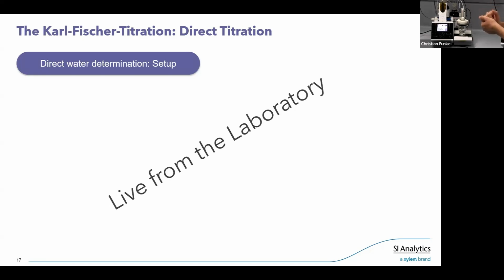Okay, but we saw on the graph this direct method is not really suitable. Therefore, we changed to such a system you can see now on the screen. So this is still a direct method, but now the main problem was that the extraction time is not fast enough with the first system we used. So therefore we wanted to increase the extraction speed by heat.